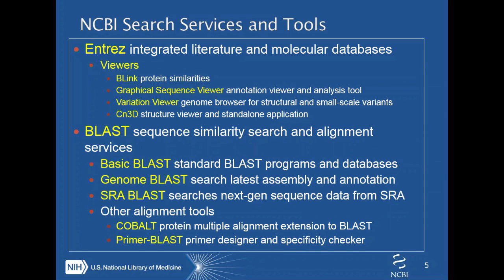There are a number of viewers associated with Entrez. The graphical sequence viewer, which we'll use today, is a way of looking at sequences and their annotation. The variation viewer is one of our genome browsers. And we'll even get a chance to look at CN3D, which is a viewer that can be associated with structure views on our pages, and it also functions as a standalone application.